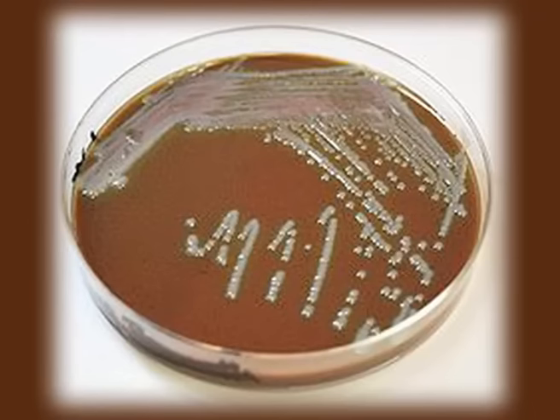Now, as I told you, if we add antibiotics to the chocolate agar medium, it makes it more selective. Like if we want to grow the genus Haemophilus only, then we can use bacitracin, which will only permit the growth of Haemophilus on this chocolate agar medium. Otherwise, chocolate agar medium is non-specific in nature, and it can be used for the growth of those pathogens which require blood for their growth.